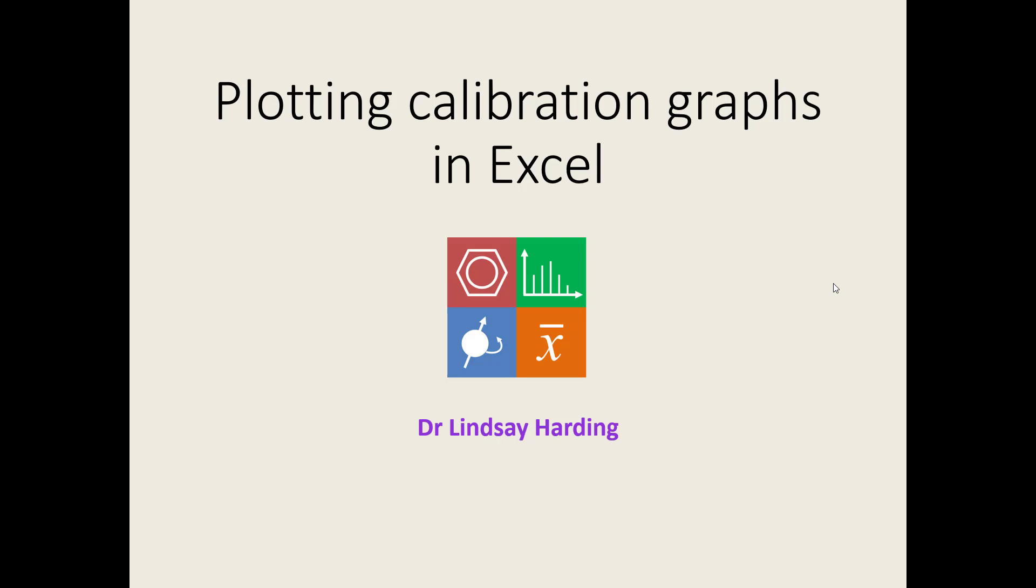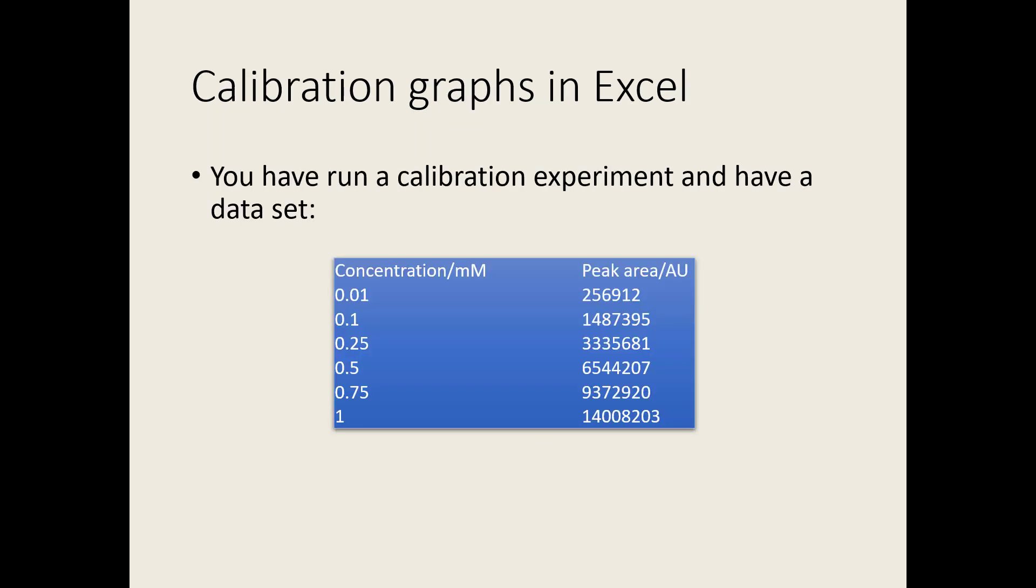Hello and welcome to this video on how to plot a calibration graph using Excel. Let's assume that you've run a calibration experiment with a set of external standards. You now have a data set of concentrations and their corresponding instrument responses, in this case peak areas from HPLC.